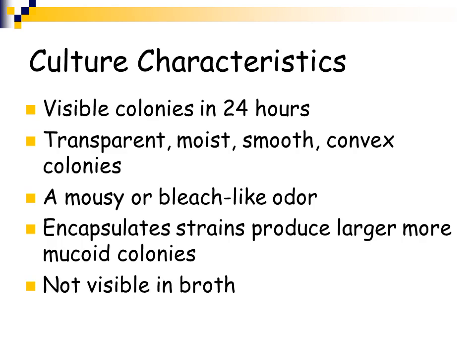And if the organism is grown up in a broth, usually when you grow bacteria in a broth, it gets very, very densely cloudy and turbid. That is not as common with Haemophilus. One of the reasons is because Haemophilus requires blood to grow, and most broths don't contain blood in them. So Haemophilus does not grow very well in most broths.